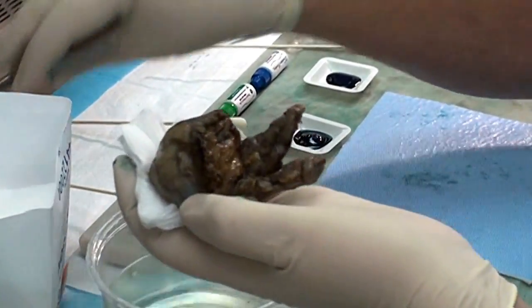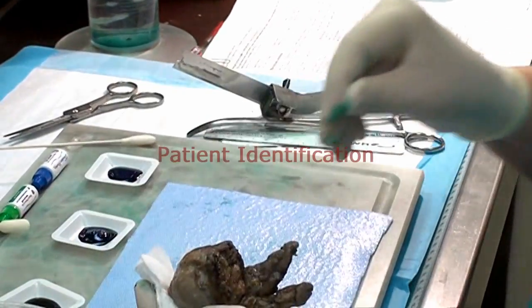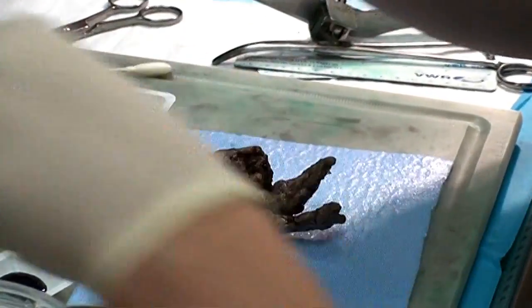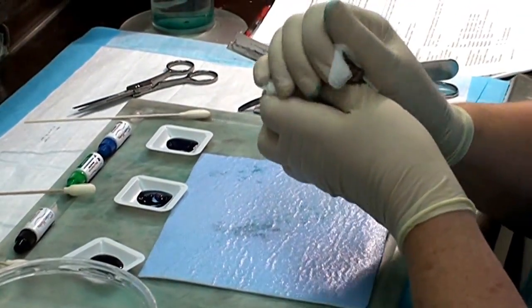The first thing we do is verify that the patient's name on the container matches the paperwork, and this one does. We're going to dry it off as much as possible, and that helps the adhesion of the ink.